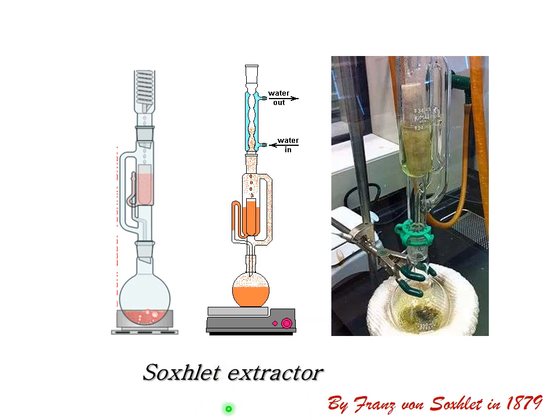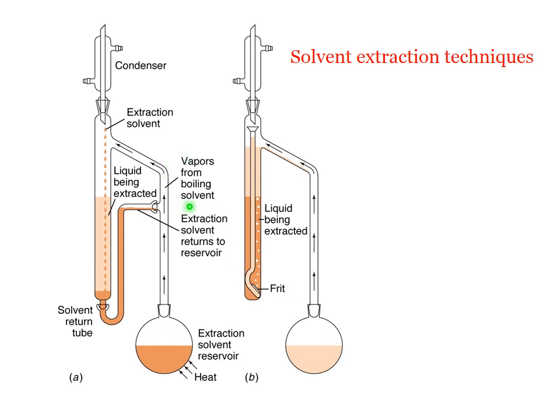It's named Soxhlet after Franz von Soxhlet. It's an old device. Soxhlet was an interesting person who introduced pasteurization of milk and milk preserves. The design was made for removing fat from dairy. The same approach can be applied for extracting from liquid solutions.